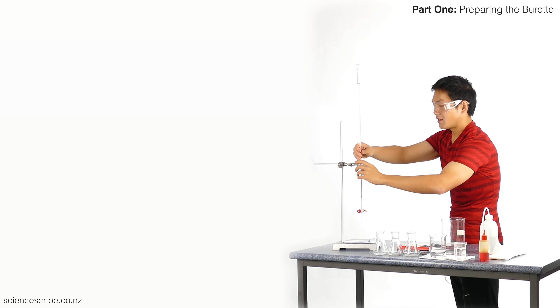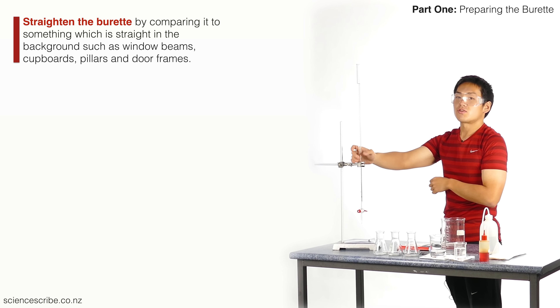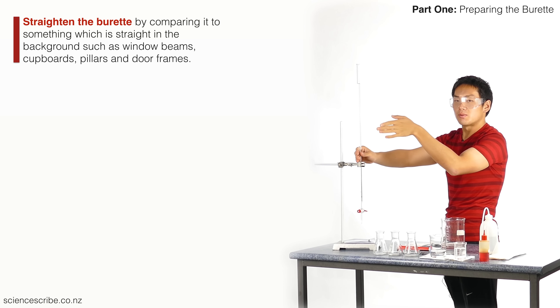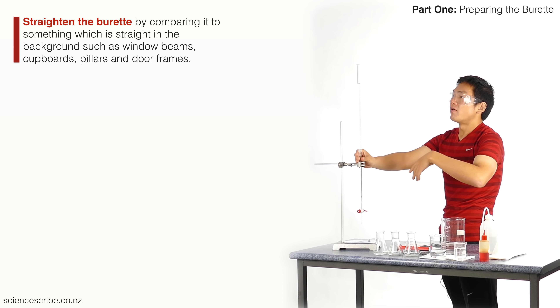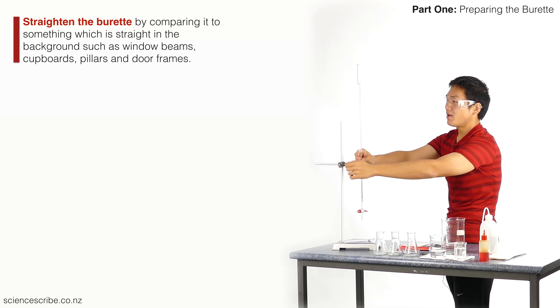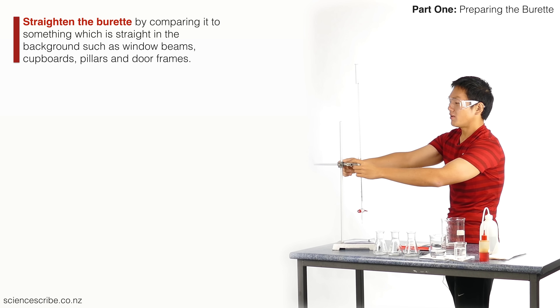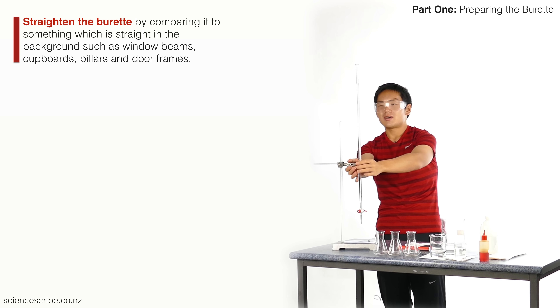The last thing you want is to run a titration and then have a 50 or 60 dollar bill to replace your burette — these things are not cheap for high school students. To check that my burette is straight, I always tell people to look towards a wall or window and find something straight, like a pillar or a straight edge on the window, and just line it up with that. I'm going to be very careful adjusting my burette, lining it up from multiple angles.